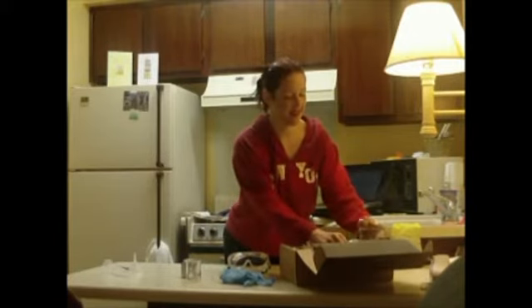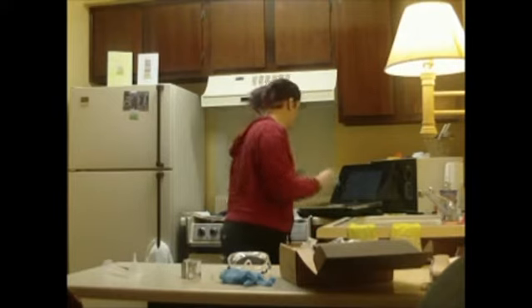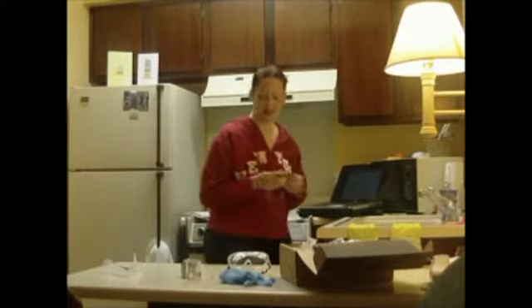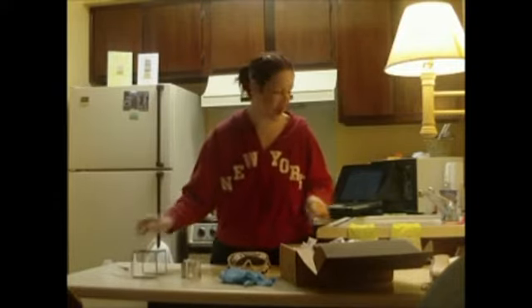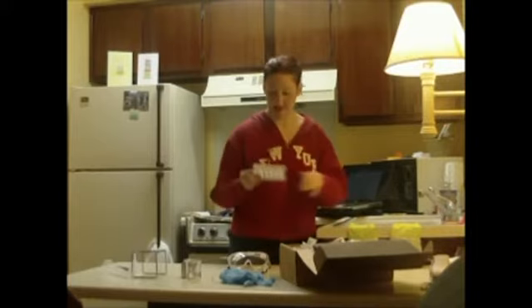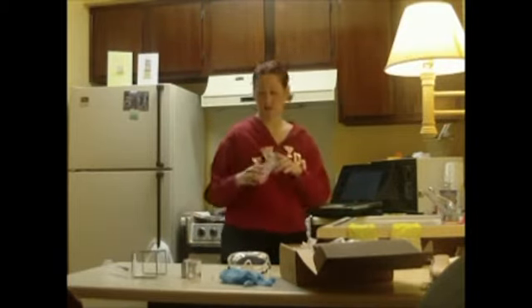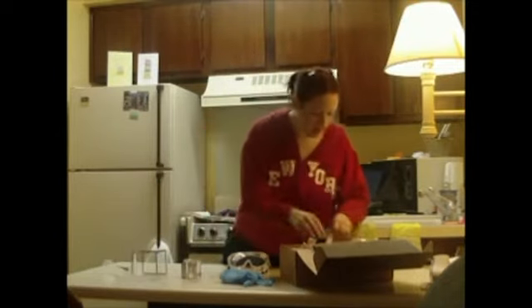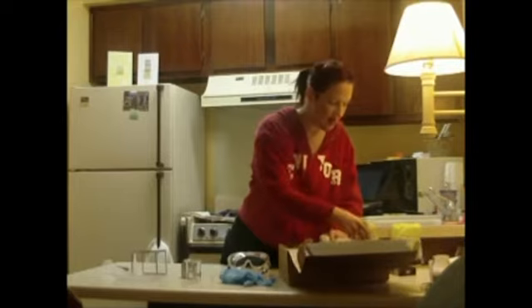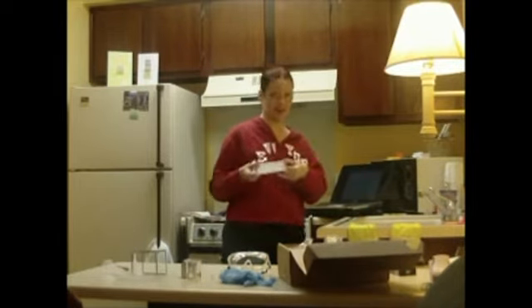So we're just going to need one test tube, and that came in the bubble bag, but I already recycled that. I'm pretty sure we're going to need a burner stand, if we're going to use burner fuel. I'll just set this aside here. I know we're going to need a well plate. This one is a well plate 24. Here is our well plate 96.